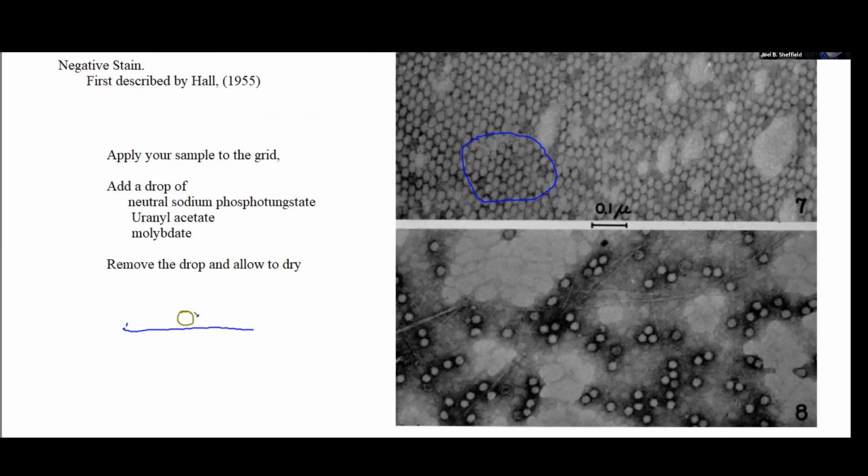So it will have wet the sample, presumably, and it dries down, leaving something like this behind. And what you see here then is this equivalent, a white sample with dark edges. Now, this was done in 1955, and the resolution of his microscopes wasn't particularly impressive.